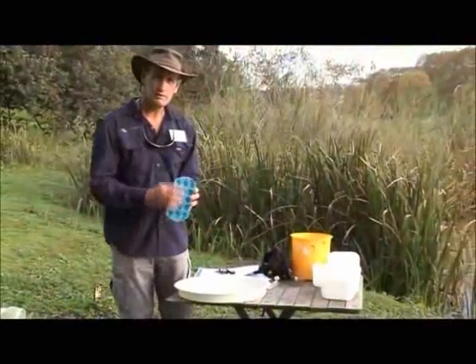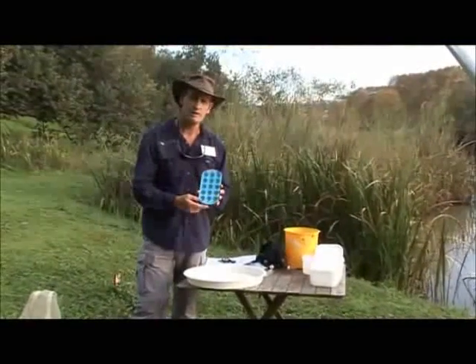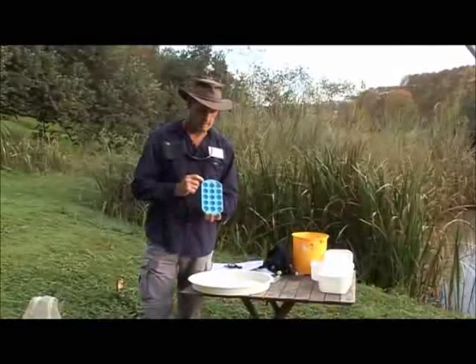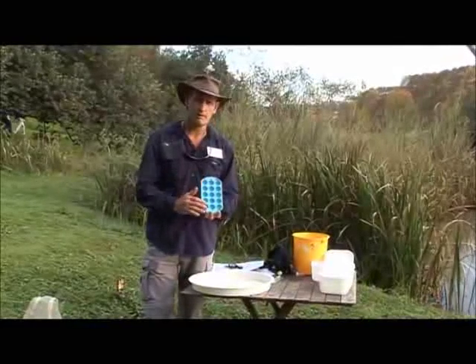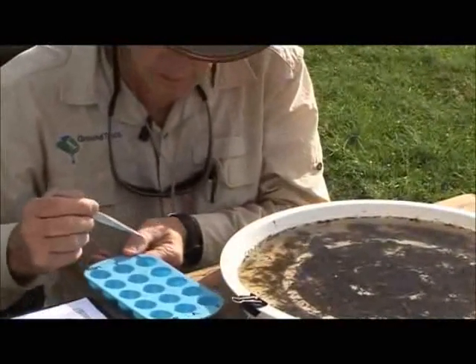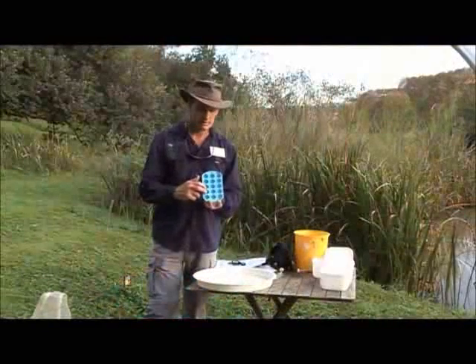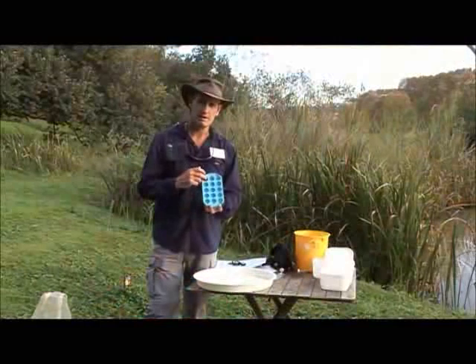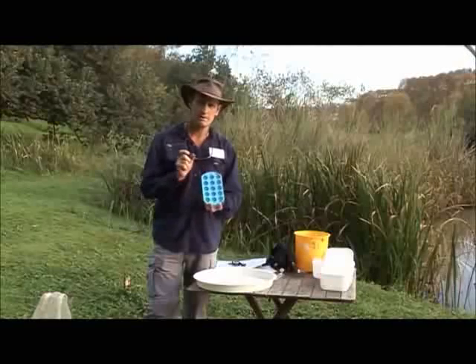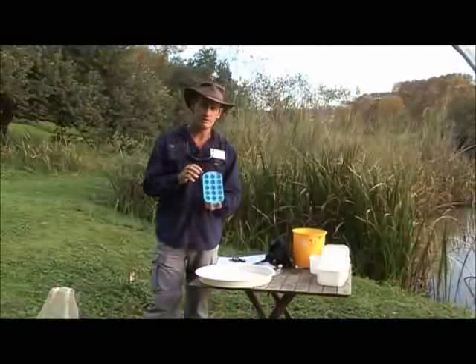Very useful, not essential, but almost essential because of the way SASS5 is structured, would be a small ice cube tray, white or blue, a light color, allowing you to put particularly the baetids and hydropsychids. You will see later in this production how to handle the baetids and hydropsychids, and the requirement to distinguish between those particular species and the numbers of different species of those in your total sample.